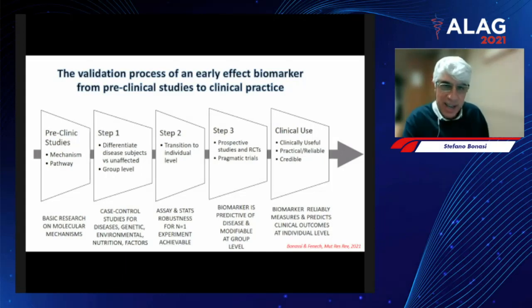So, approaching the end, the results about the link between DNA damage measured with the Comet assay and the risk of mortality are quite strong. Obviously, the design and the study have several weaknesses, so it's not a definitive result, but it's quite an important result. For epidemiologists who love dealing with mortality and diseases, what we really want to do is to predict diseases.